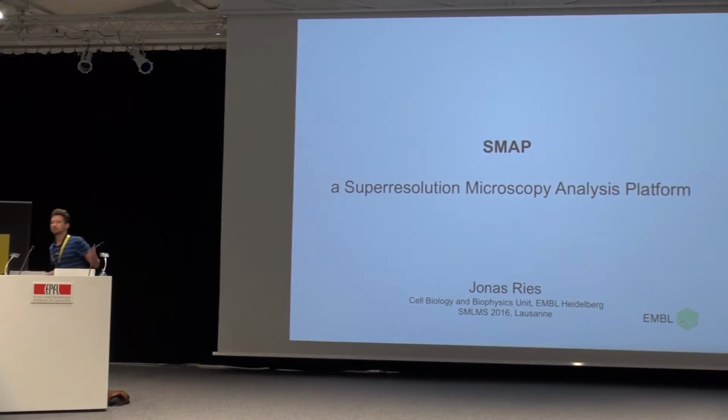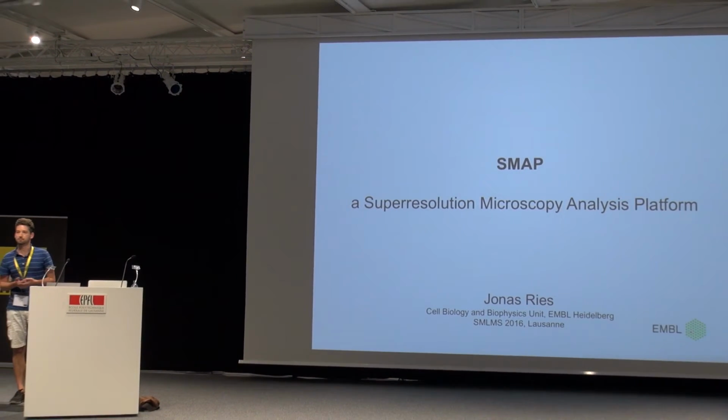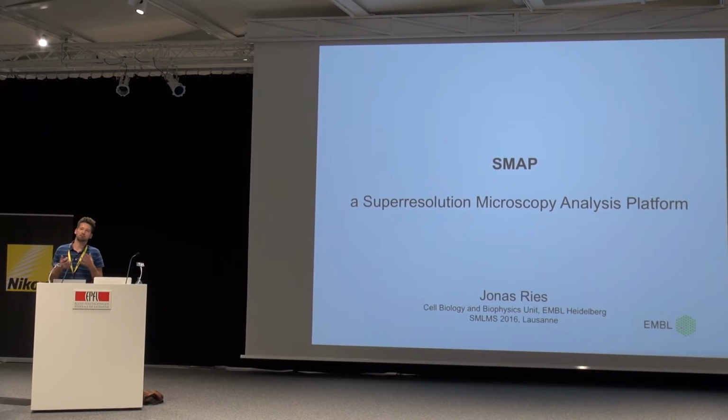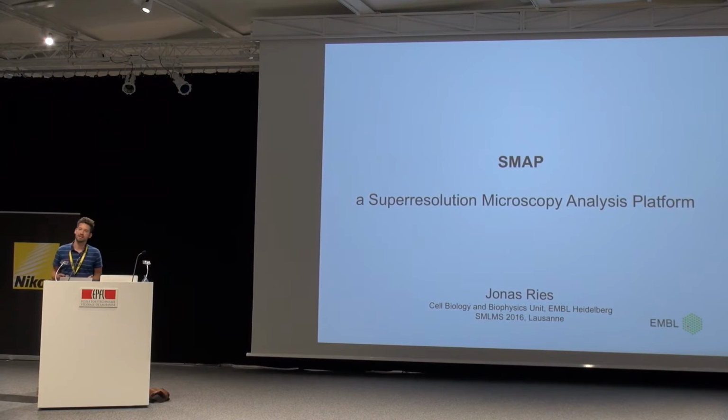So it's really great that we are meeting here to compare our software and that so many people participated. But I think it also points in the direction of maybe a problem in the field. And that is that so many groups are developing their own super resolution software from scratch instead of using existing and really good software packages. And this continuous reinvention of the wheel wastes some resources which might be better used to implement new ideas, new fitting algorithms, and so on.